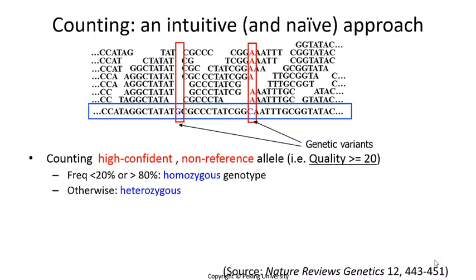It is impossible to give objective criteria for the reliability of the result. Therefore, in practice, probabilistic SNP calling and genotyping models are used more. We will illustrate that with the most simple probabilistic model.